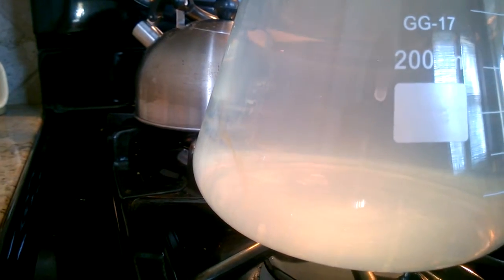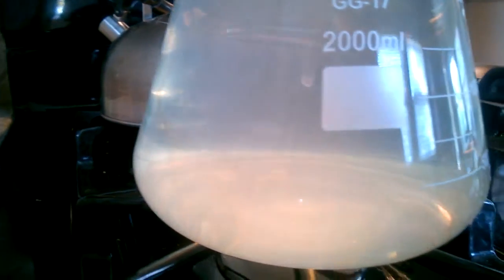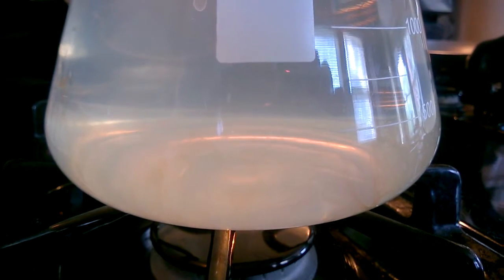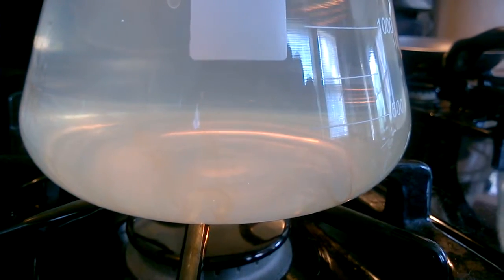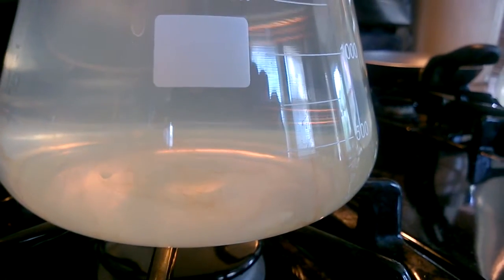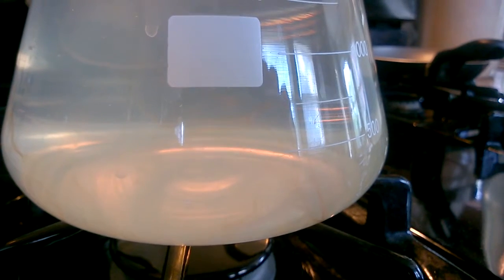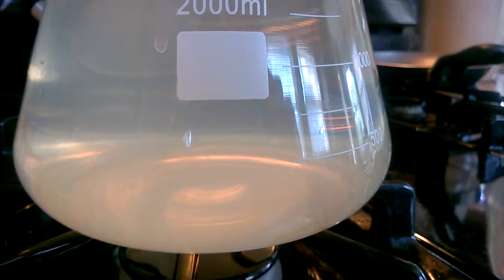Now I turn the fire off. Shortly thereafter you start seeing these thin sheets coming off the sides. This is stuff that after we cleaned it with soapy hot water and a bottle brush we still could not get off. PBW is amazing stuff.